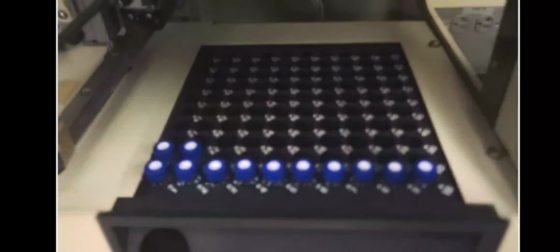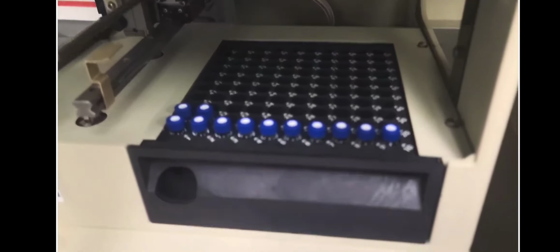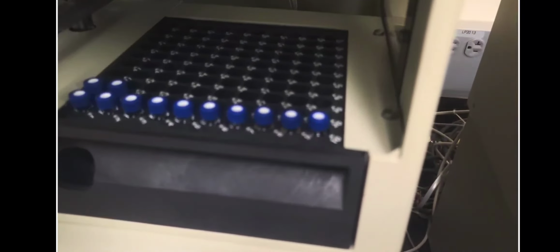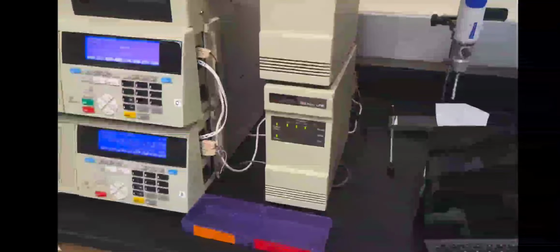HPLC, as its name implies, is differentiated from the others mainly by the high pressure at which it is typically performed. Due to the high pressure involved, at times up to 1,000 times atmospheric pressure, HPLC is usually not used for the separation and purification of biomacromolecules like proteins, but it is often used to separate small biomolecules and peptides in biological samples.